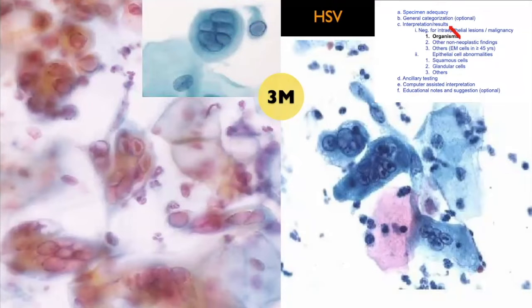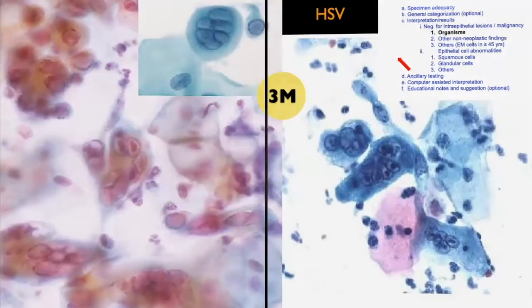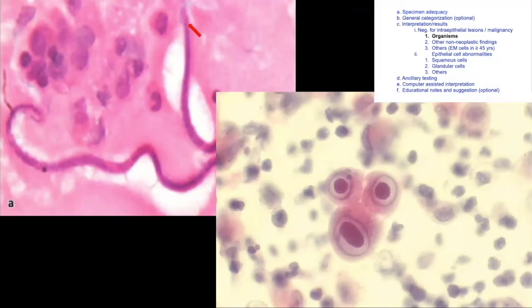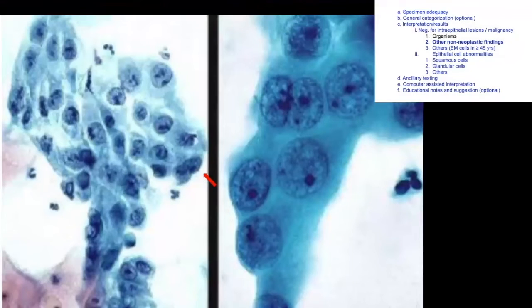Here you can see an 'owl-eye' appearance with prominent intranuclear inclusions, which are characteristic of CMV. Always ask for the history of immunosuppression or organ transplants. And here is what I mentioned before — microfilaria in the PAP smear. In India, microfilaria can be seen in cytology (urine, PAP smear) and in histopathology of lymph nodes — commonly tested in Indian exams, in addition to peripheral smears.